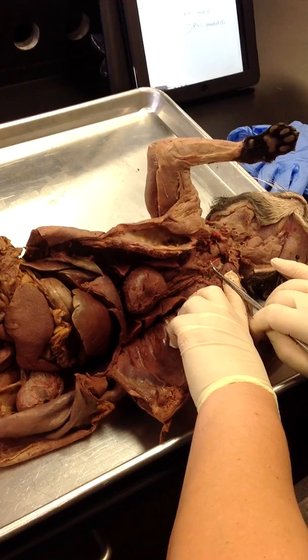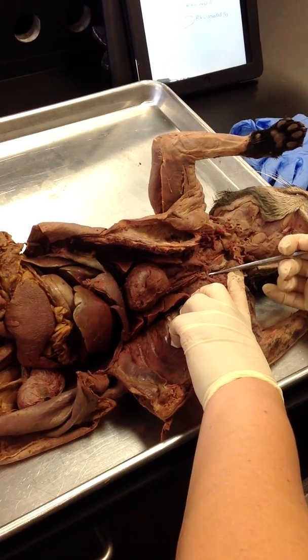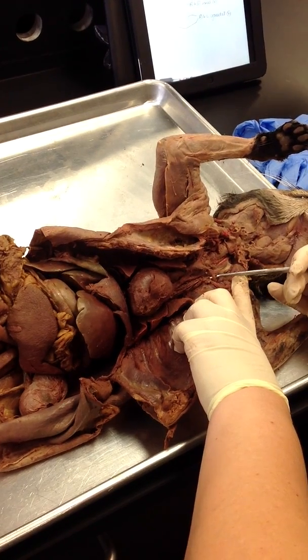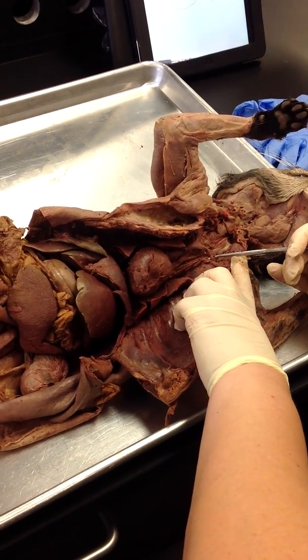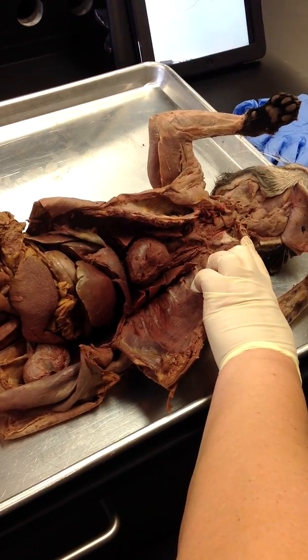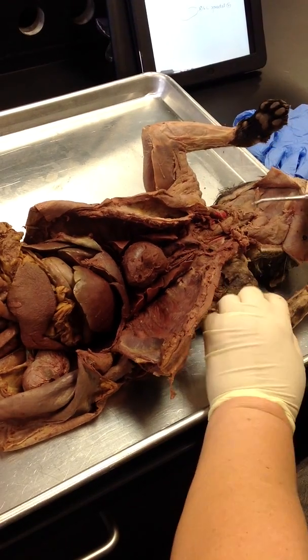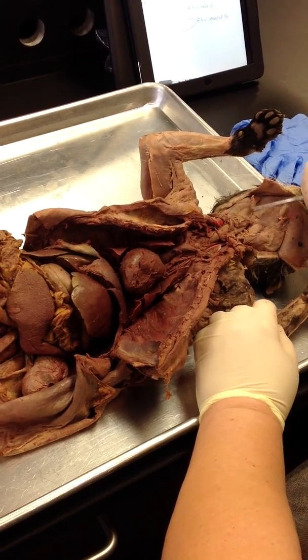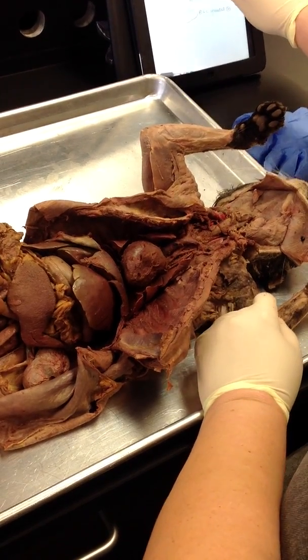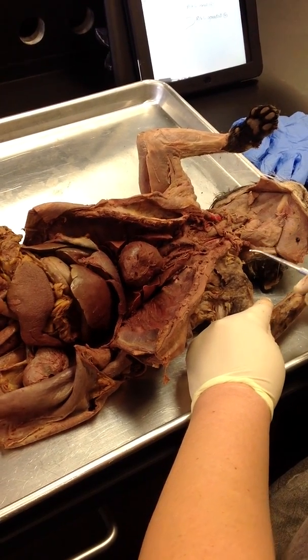Left external jugular vein, and then this fork that goes this way to the side would be the left subclavian vein, okay. And so the left external jugular goes all the way up. If your cat has a transverse jugular, it's going to be right here. Not all cats have them, right? So see how it goes across like an H? That's where the transverse jugular vein is going to be.